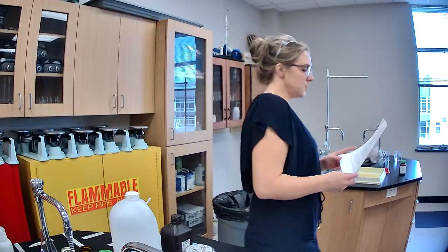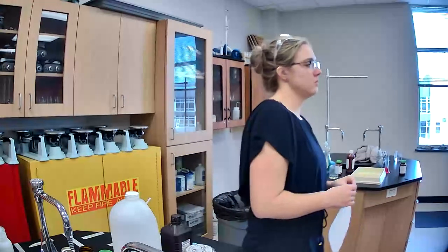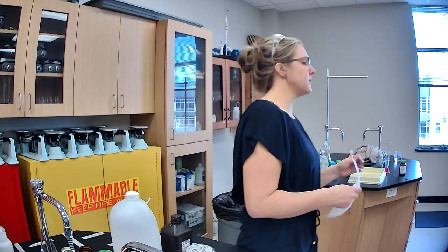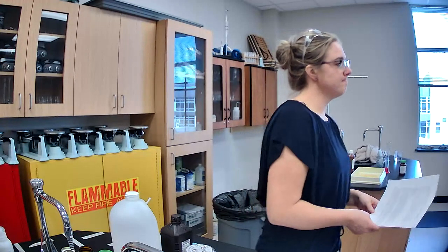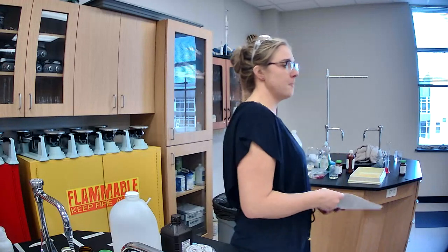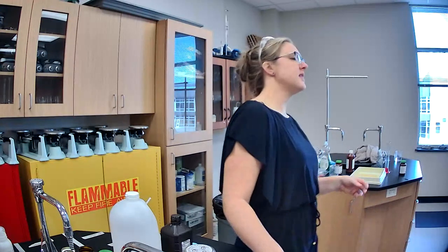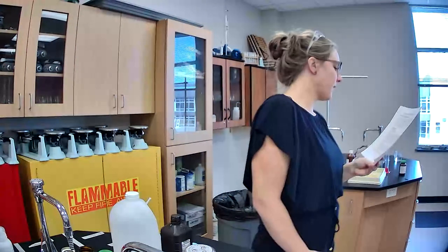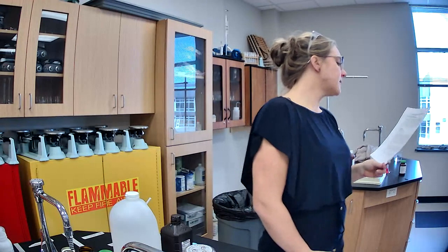If those iron filings, aren't they just like filings from a nail? From some kind of iron or metal, yeah. Could you just drop iron and water in a bag and then heat up? Well, no, because, okay, let me read the explanation. You know that leaving unprotected pure iron... nails, I think, are a little more like steel than iron. I don't really know.